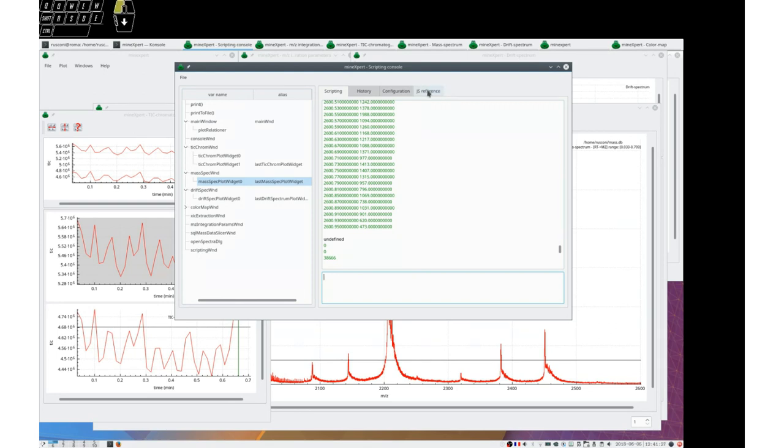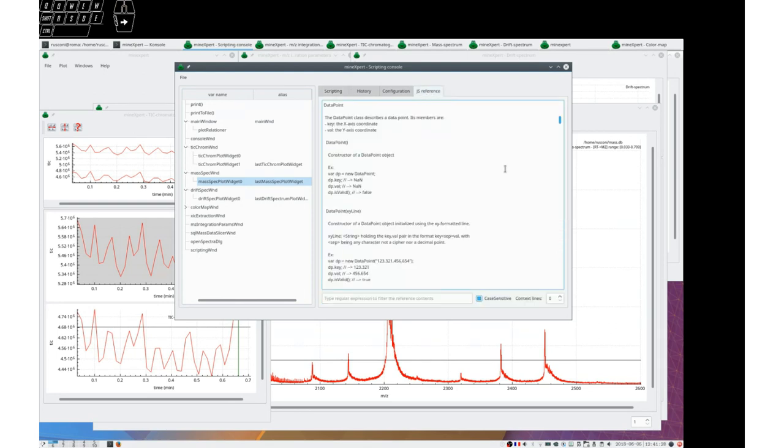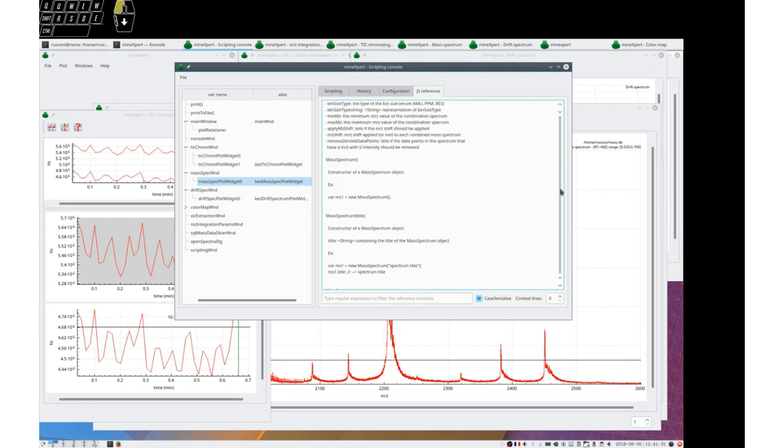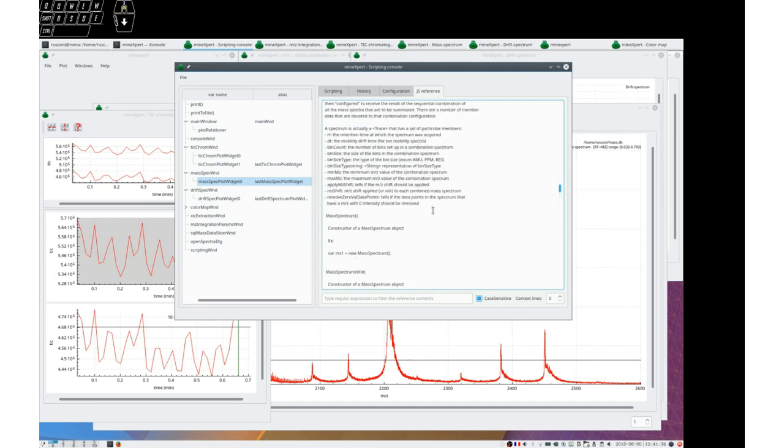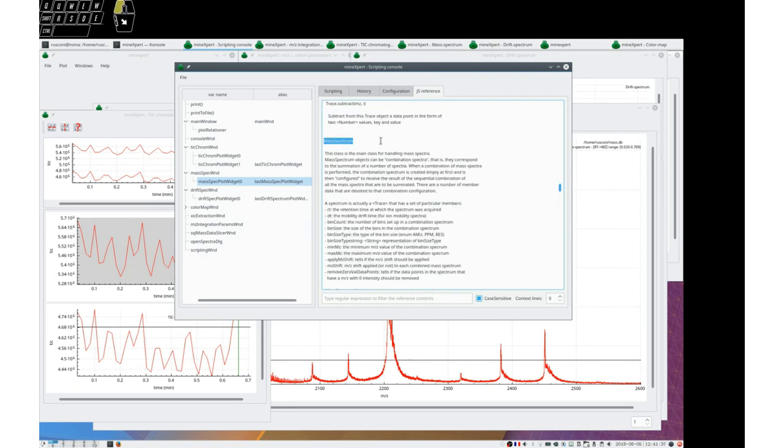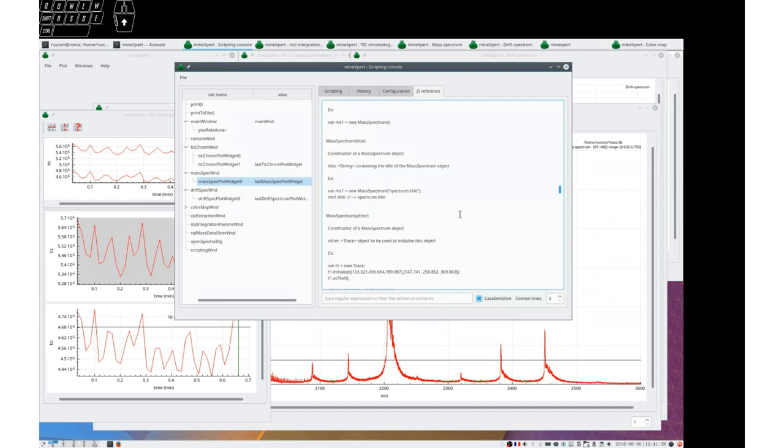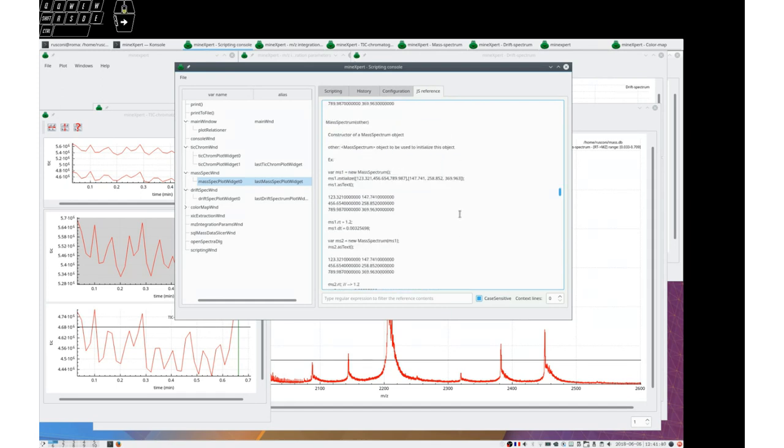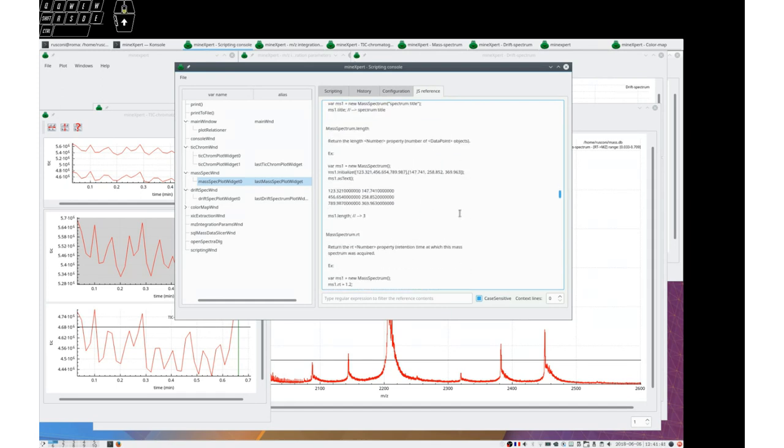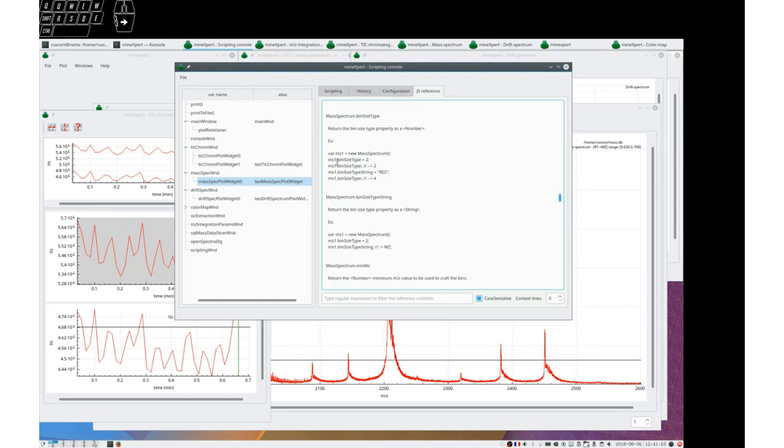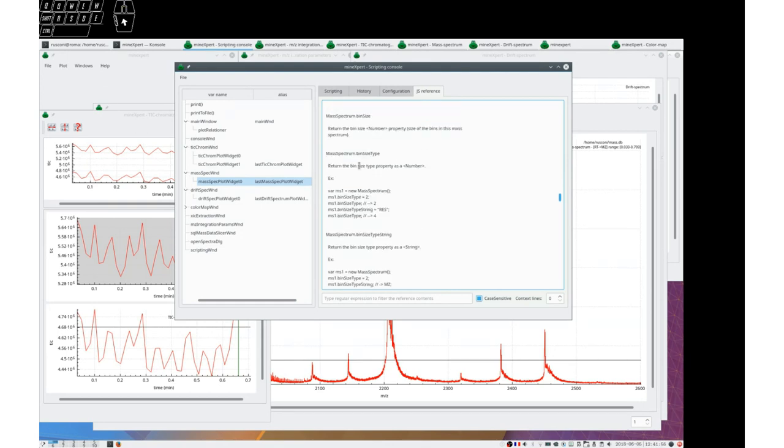So how can we discover what we can do with all these objects? Remember, there is this Javascript reference. So we may go to the mass spectrum chapter and look at all the functions that we can have. And remember, all the documentation of the various functions of the class objects are provided with examples.